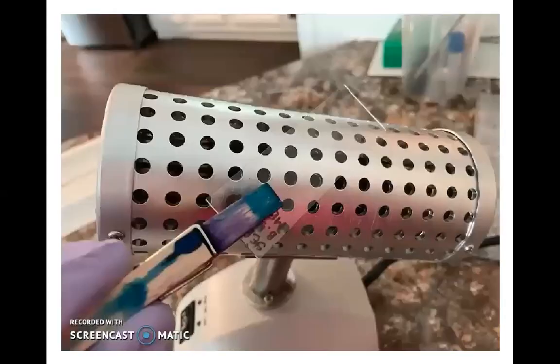The next step in preparing a smear for staining is critically important. That step is called heat fixation. We're doing a couple things when we heat fix a smear of bacteria or other microbes. Number one, we're going to warm up the surface of the slide so that the lipid in the membrane of those cells will stick to the surface of the slide. This is such an important step, and unfortunately, sometimes it gets overlooked.